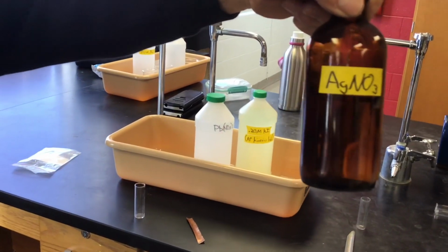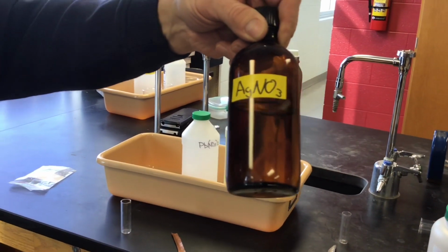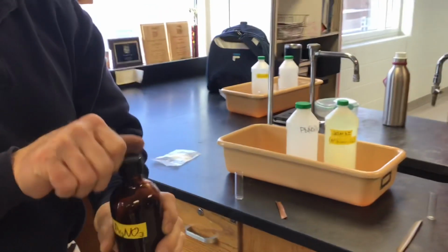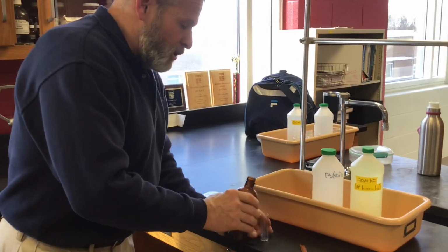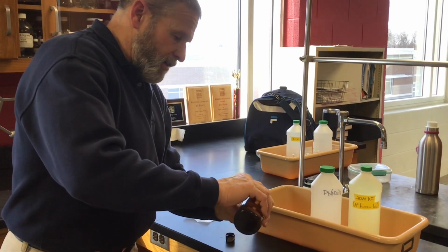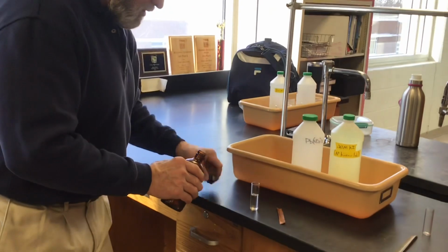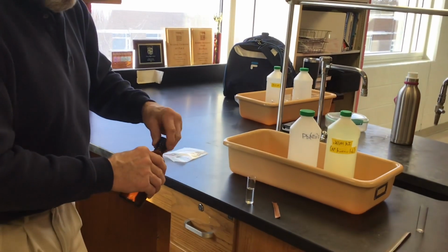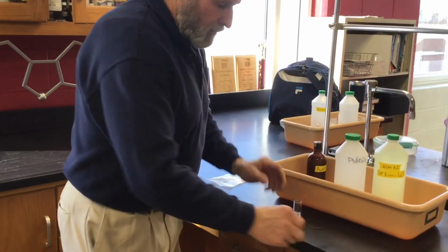Keep the silver nitrate in a dark bottle or a brown glass bottle to keep the light out, because it decomposes in sunlight. So what I'm going to do is put a little bit of the silver nitrate into the vial here. This one reaction is slow. All the other reactions happen almost instantly, but that's why we're doing this one out of order.